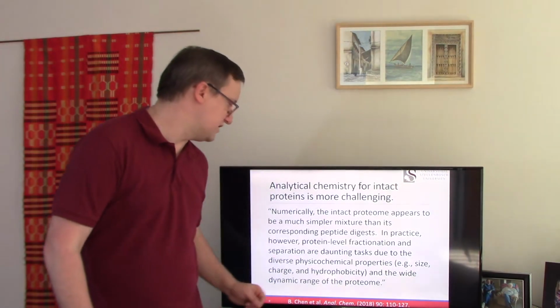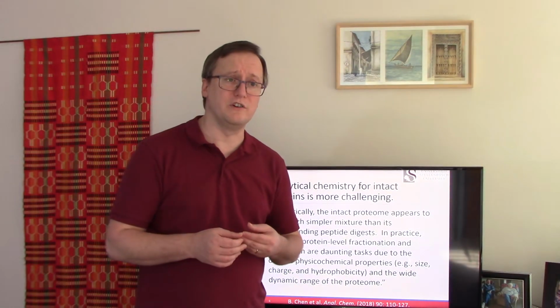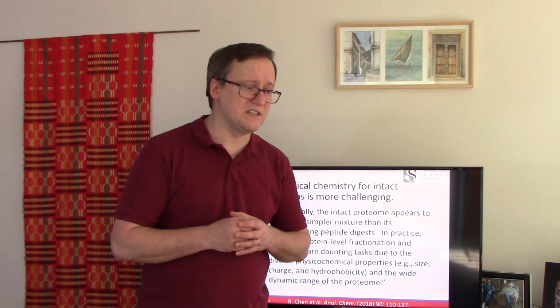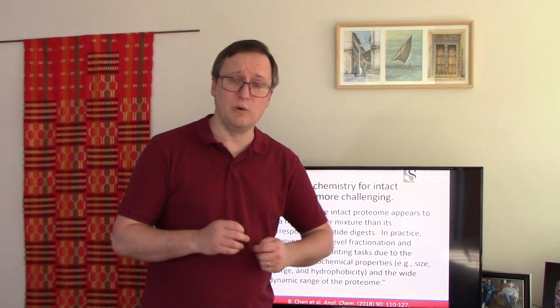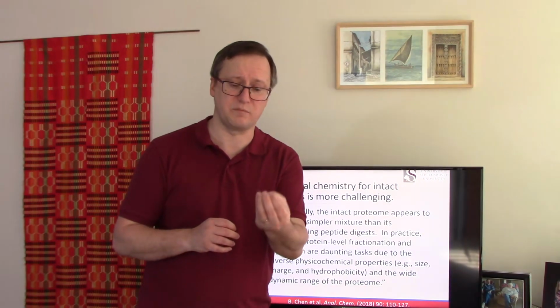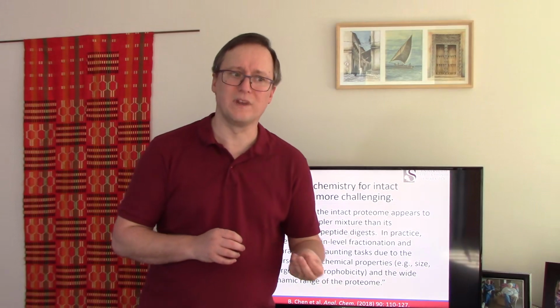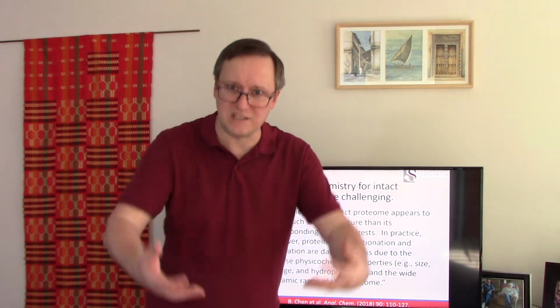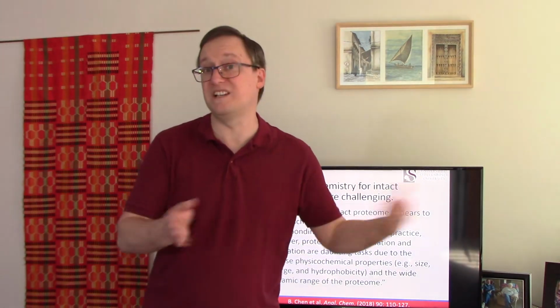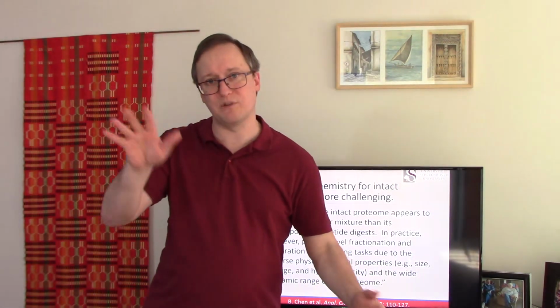We're going to talk about the range in protein size in just a moment, but we can also think about charge. It may be that if you are looking at something like a histone, you have a tremendous amount of basicity associated with this protein, and that basicity translates to a very positive charge. If you're dealing with a separation of your proteins that discriminates against highly positively charged proteins, away they go. So we need to be able to deal with this great range of biochemistry as we work.